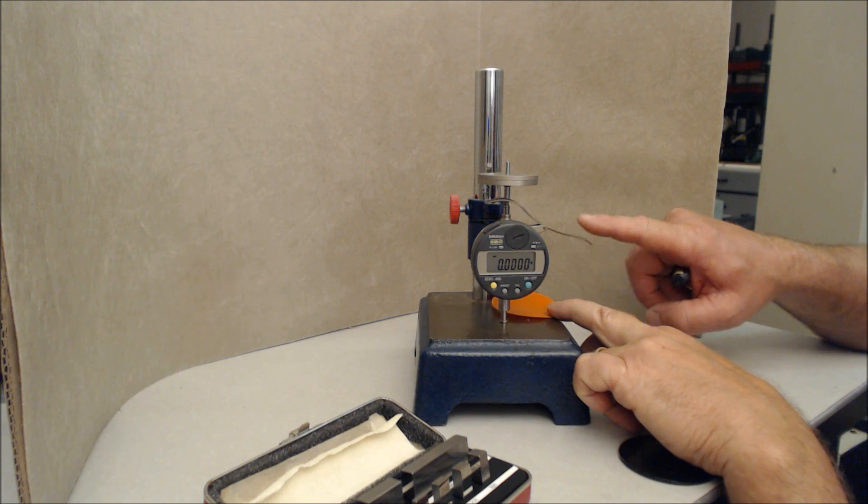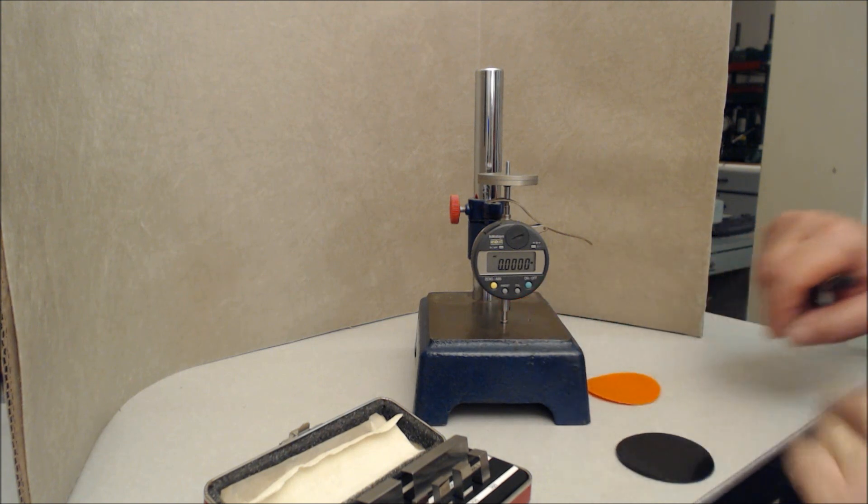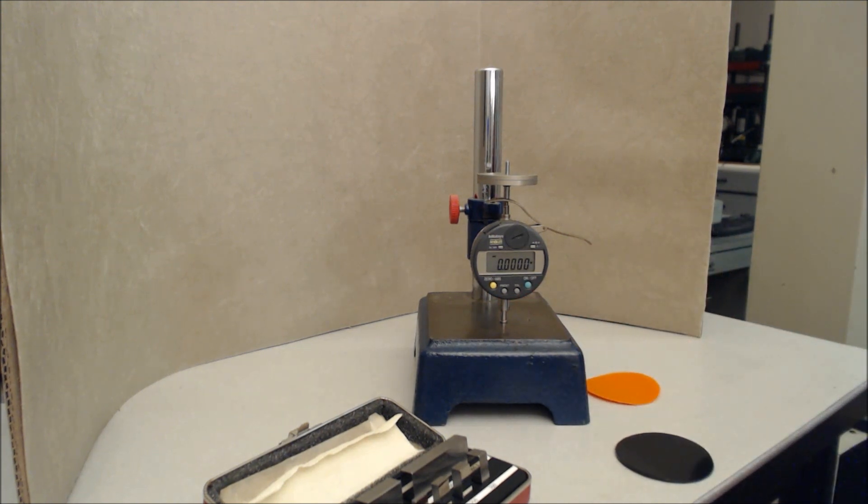I'd like to see the return to zero of the gauge after the test, and certainly it returned to zero. This is a very good test.